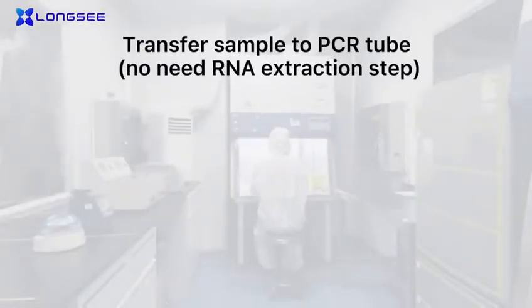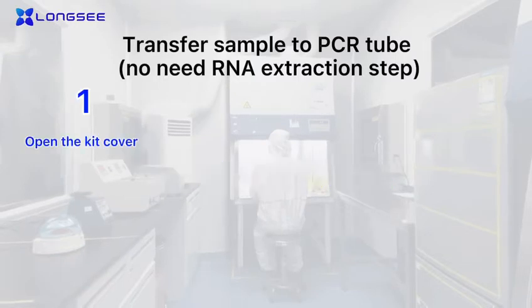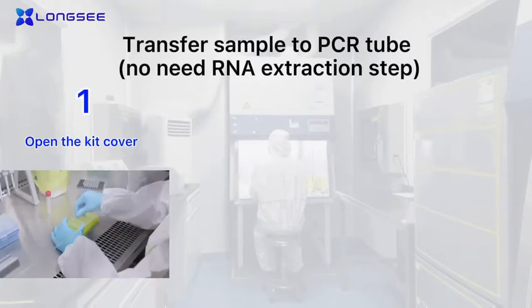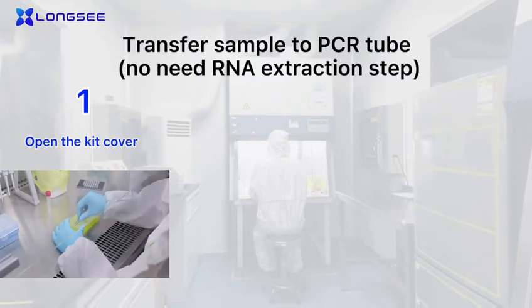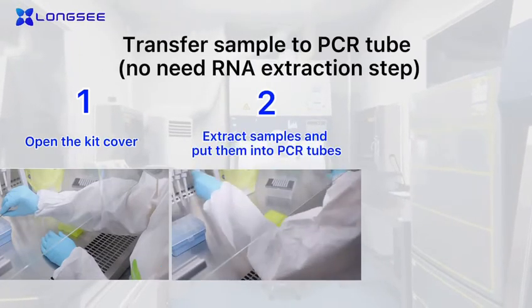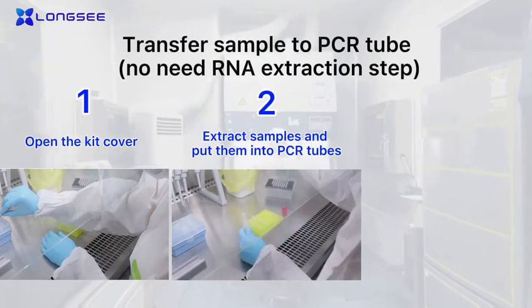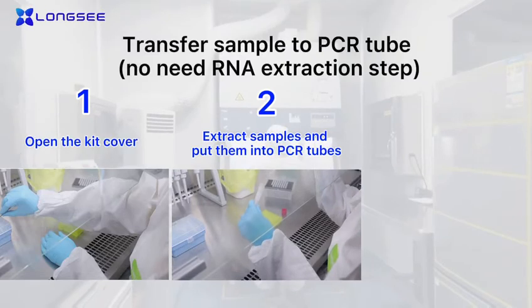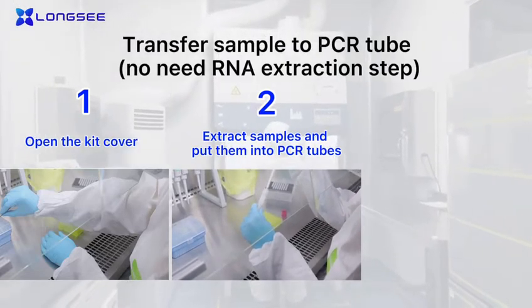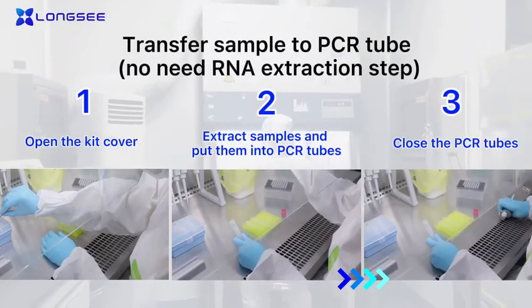Transfer the sample to a PCR tube — no nucleic acid extraction step needed. This operation must be performed in a biological safety cabinet. Open the kit cover, extract samples and put them into PCR tubes, then close the PCR tubes.